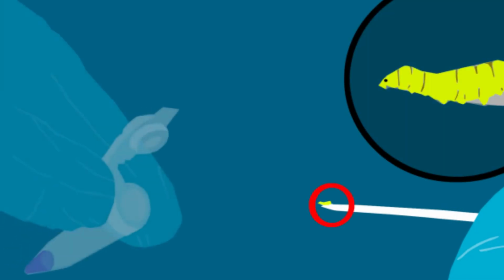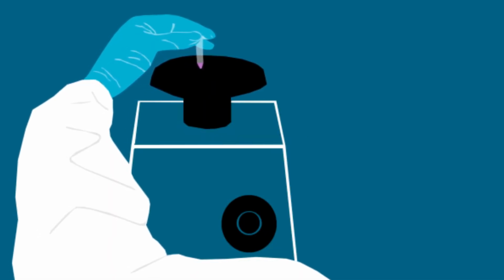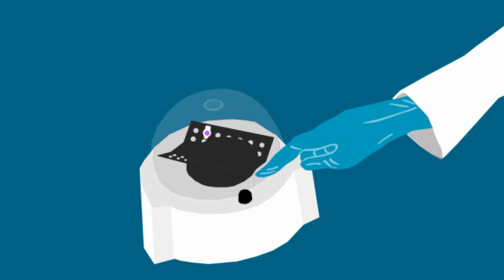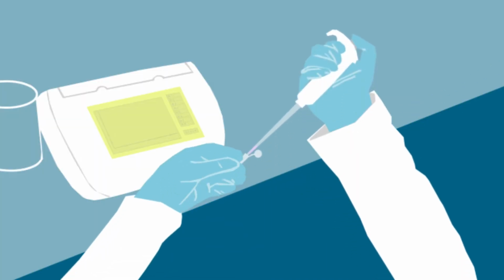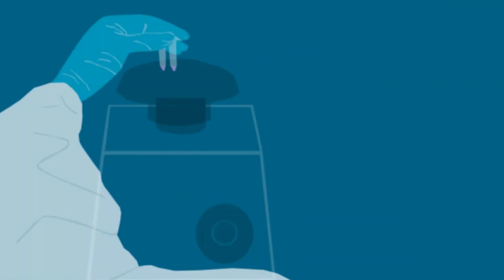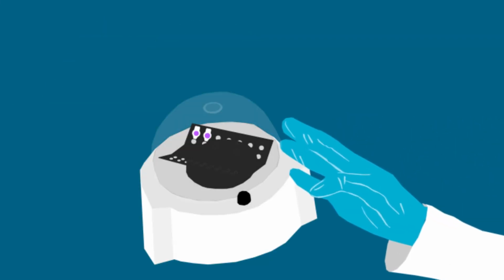First, I transfer the suspicious insect material into an extraction tube. I boil it in an alkaline solution for 5 minutes at 95 degrees Celsius. I then mix the tube on the vortex. Since this can cause a small amount of the liquid to stick to the lid, it is then briefly centrifuged. Now I pipette a small amount of the violet extraction product into the appropriate reaction tube. In the following step, the tubes are mixed again and briefly centrifuged once more.